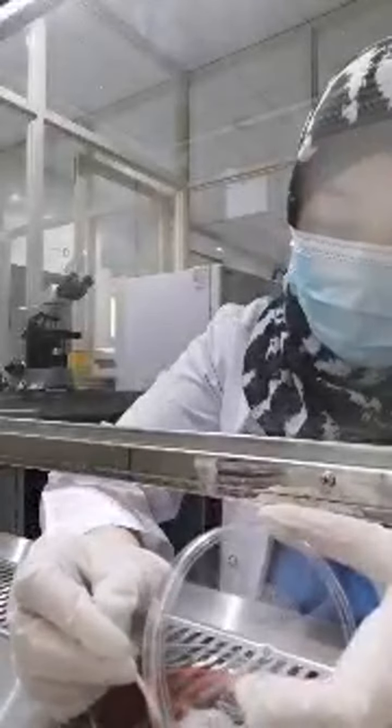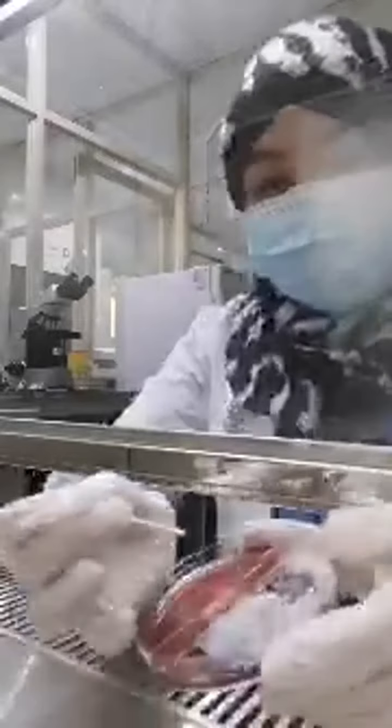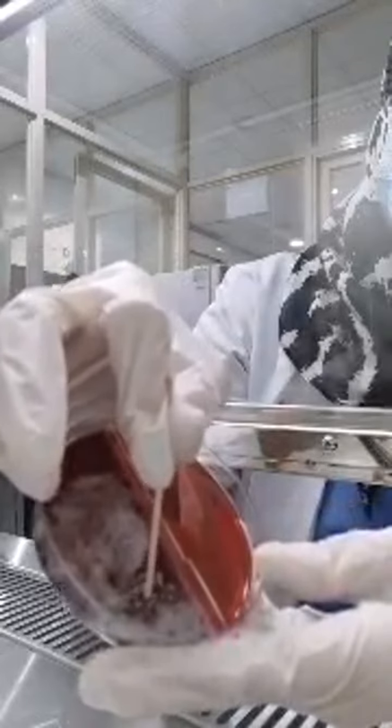Can you see? There's a bubble but not all. So what I do is I get the colony that doesn't show the bubbles, so it's the tiny colonies. I will get it now. This big colony will form bubbles, but these small colonies are different. So I will get this small colony only.